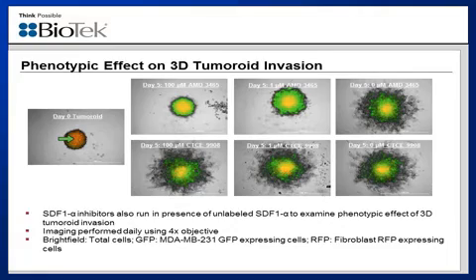And then after a 5-day incubation in the presence of the chemoattractant and either AMD 3465, which is shown by the images on the top here, or CTCE 9908, the image you see on the bottom, whose residence time was shorter than that of the ligand.